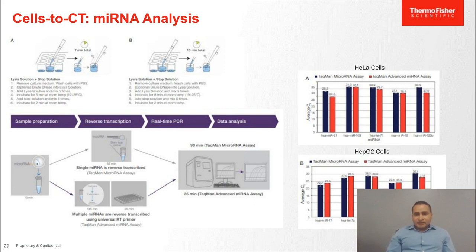Once you get the lysate, you can use TaqMan microRNA assays to reverse transcribe a single microRNA, or use the advanced microRNA assay to reverse transcribe multiple microRNAs using universal reverse transcription primers, which will then go into your qPCR reaction for microRNA expression studies.